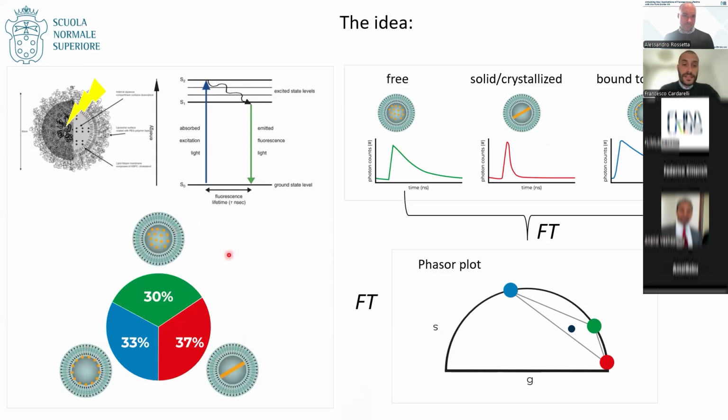So you may understand the breakthrough that fluorescence lifetime analysis can introduce into the field of nanomedicine if 30 years after its invention and patenting, we have to update our view on the synthetic identity of Doxil.